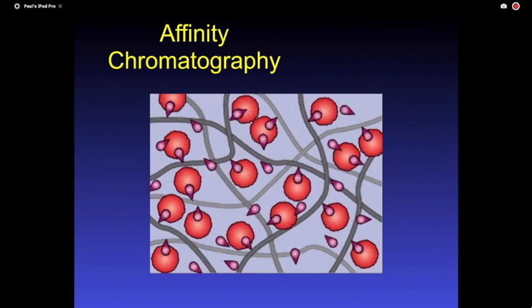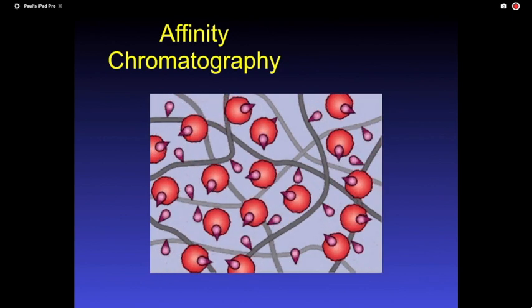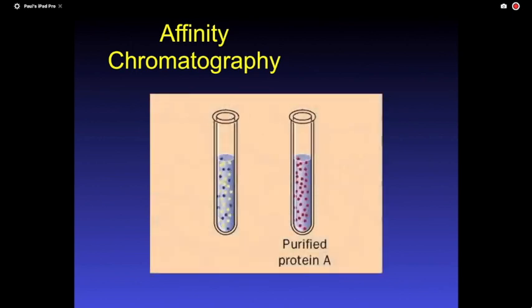Now, take a look at the eluting buffer. What I do is I put a very high concentration of that small molecule in solution. What happens is the protein will fall off. Well, why in the world does it fall off? Here's something about biological systems. Okay? When something binds, there is always a dissociation constant. In biology, things are moving and happening.